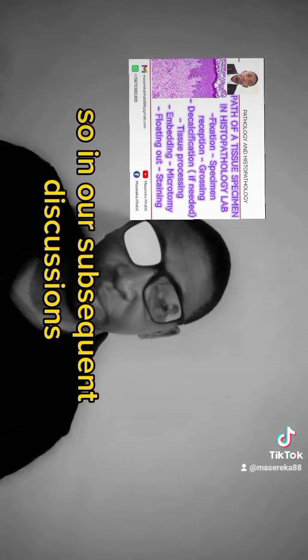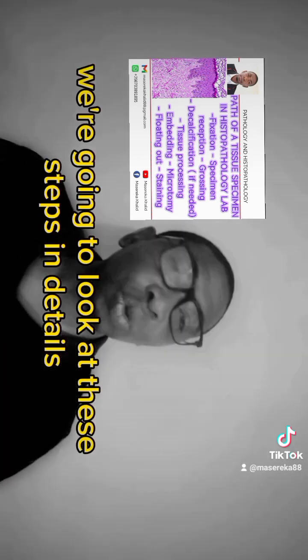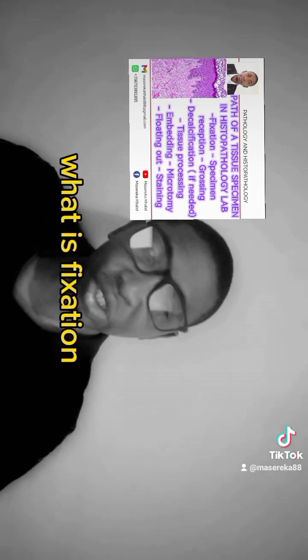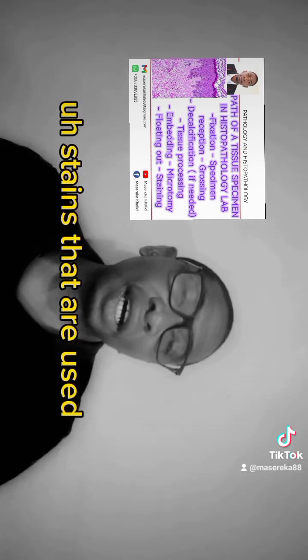So in our subsequent discussions, we're going to look at these steps in detail, from fixation, what is fixation, up to staining, and what are the appropriate stains that are used in histopathology, or in histology to be specific.